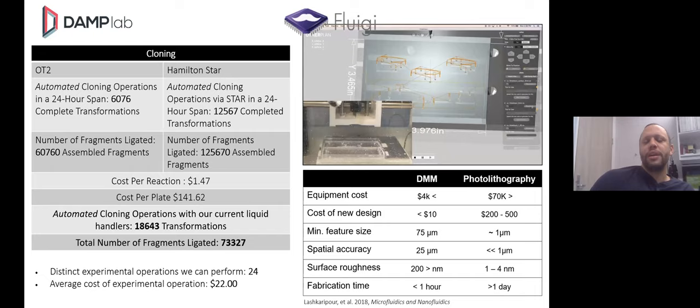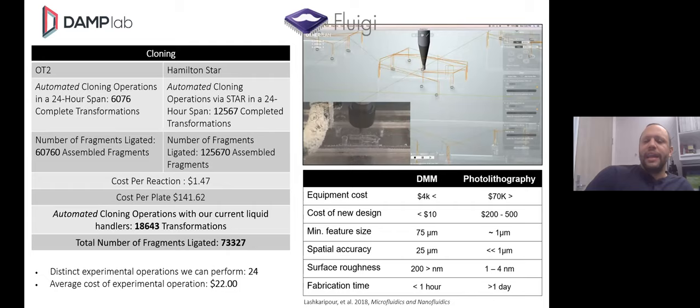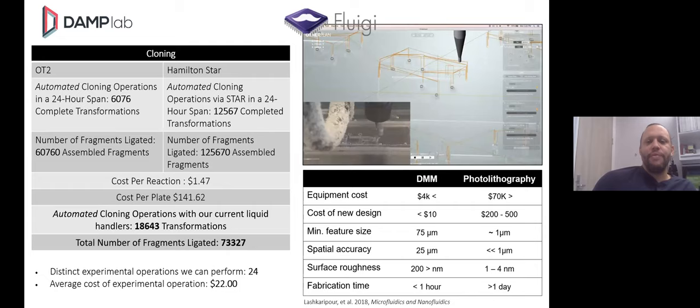You can see the feature size. Now, if you need extremely small feature sizes, these aren't appropriate, but for much of the work we want to do, these work just fine. And they get turned out relatively quickly. What I'm hinting at is we're going to be making a service where you can go online, request a microfluidic device be made, and either have that be run as part of your design at BU or get it sent to you.